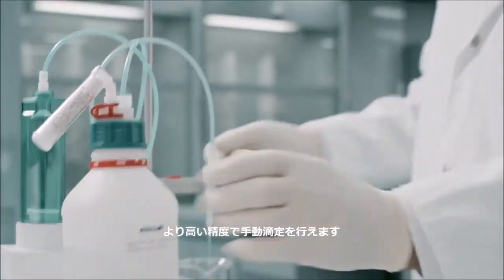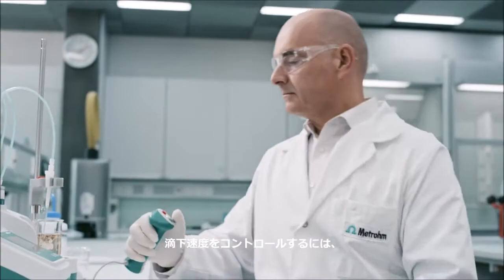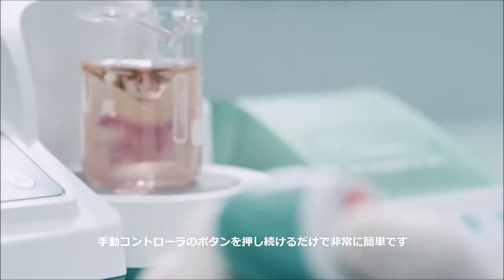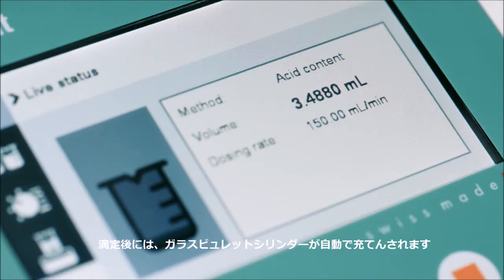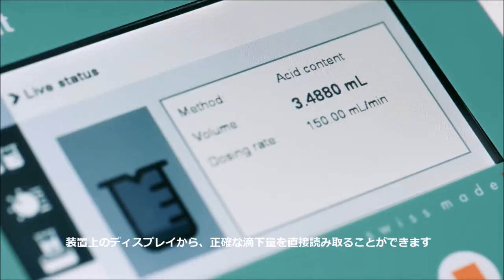Perform manual titrations with superior precision. It's so simple — to control the dosing rate, just keep pushing the button of the manual controller. After the titration, the glass cylinder is automatically refilled and you can read the exact dosing volume right from the instrument's display.